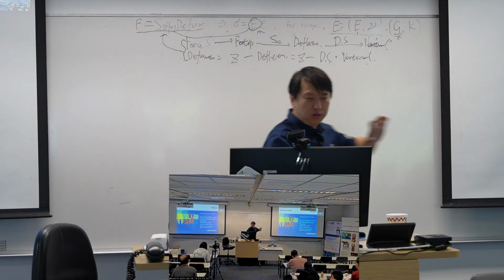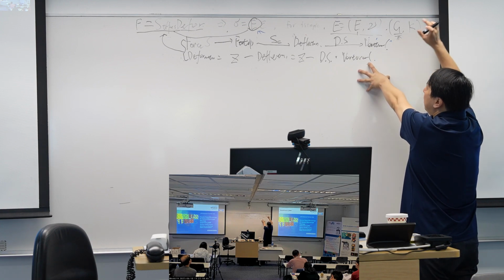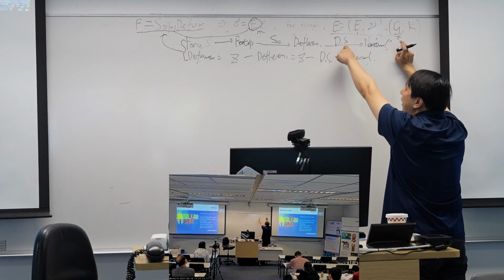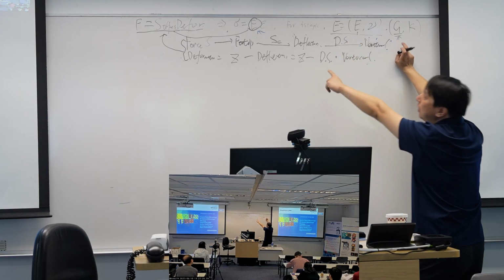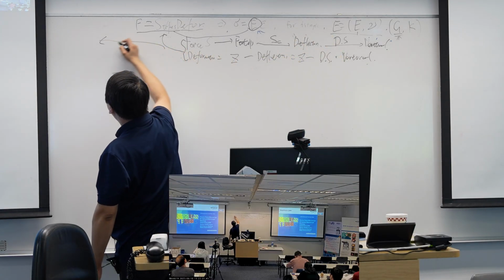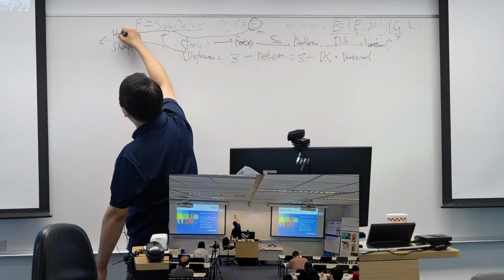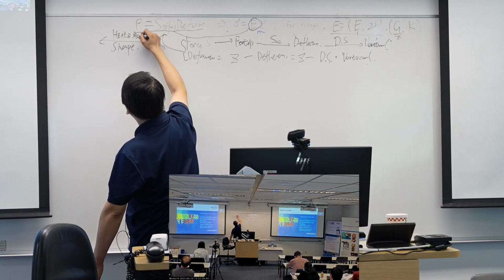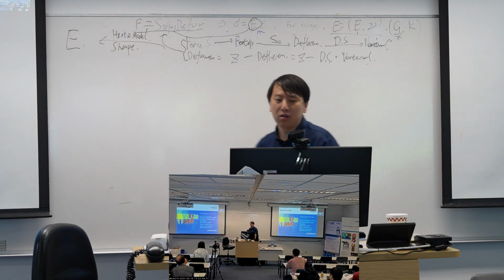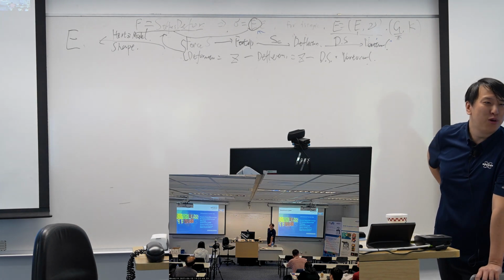So we leave our roadmap here. Again, we always capture vertical against the Z. That's the force curve we need to define. We need to calibrate the deflection sensitivity, we need to calibrate the spring constant, and then we combine it with the tip shape and the Hertz model. We can get the modulus out. That's our roadmap.